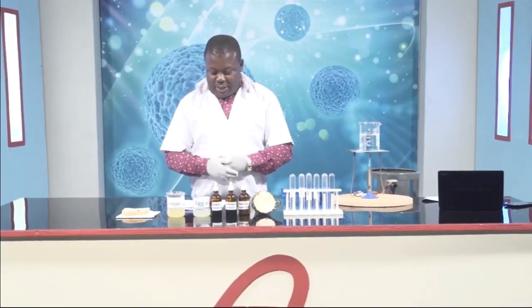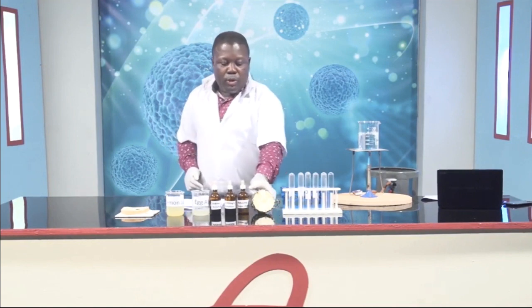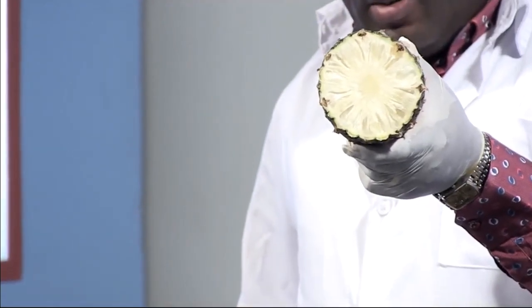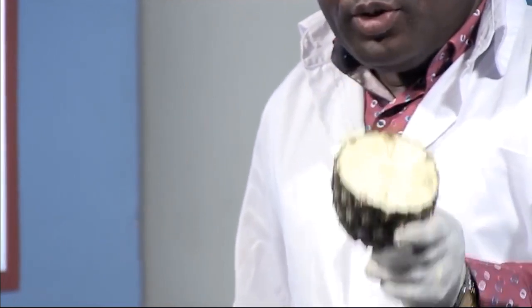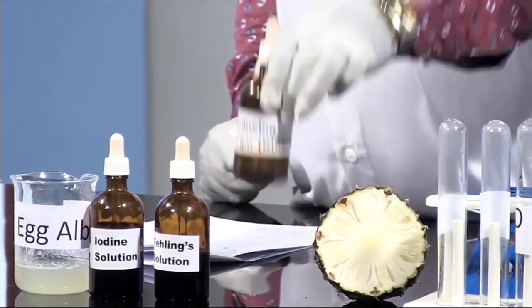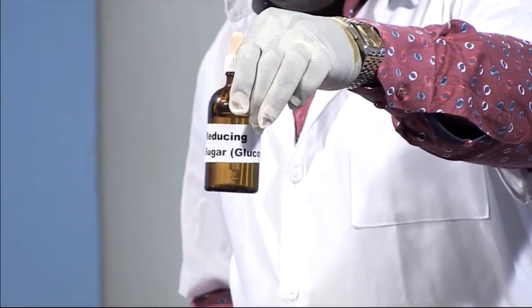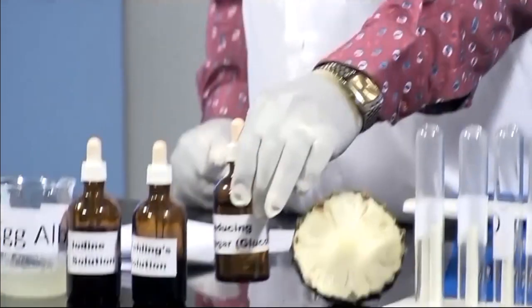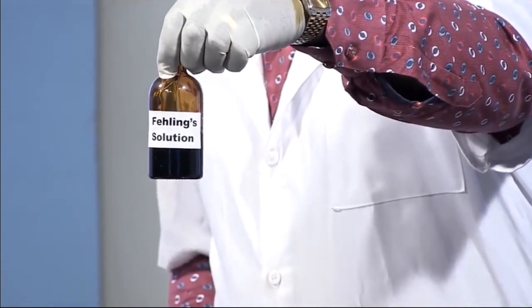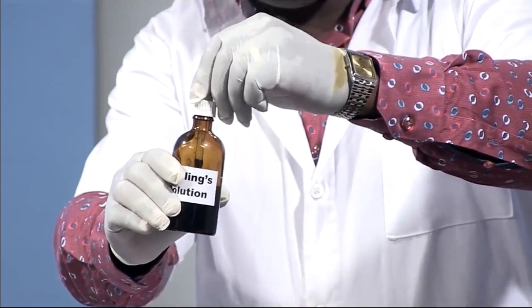So we're about to start with the simple reducing sugar. We're using glucose, but we got the glucose from the pineapple, as you can see on your screen. We have fresh pineapple. We were able to extract the juice and make it into a solution of glucose. So we have glucose solution here from the pineapple. We also have Fehling's solution as our reagent, and the color is blue.